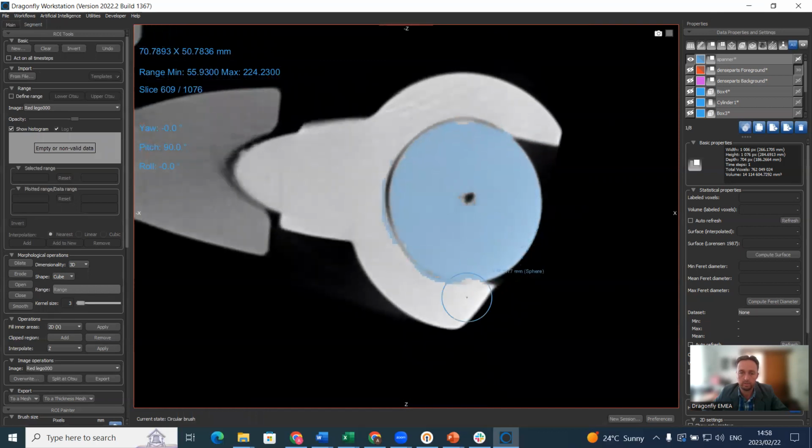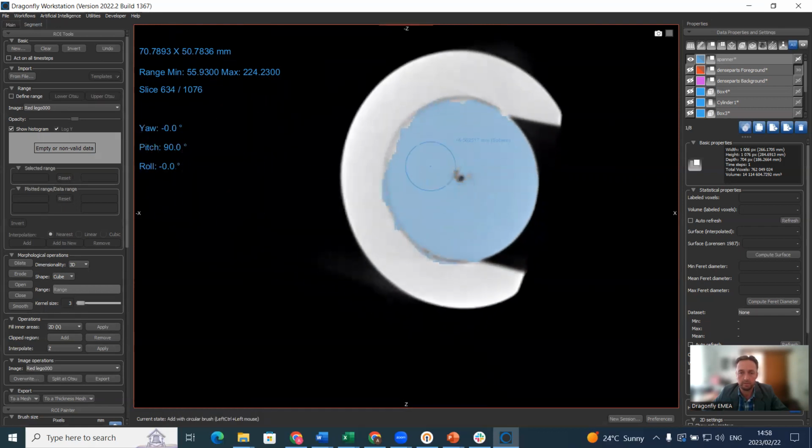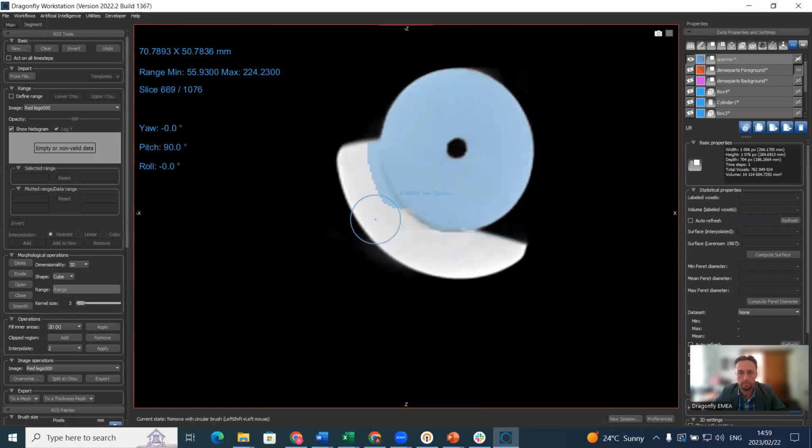Okay, and as we go along, it might take a bit of work to fix that up perfectly, but it seems in general not too bad at the moment. There's a bit of something to fix up.